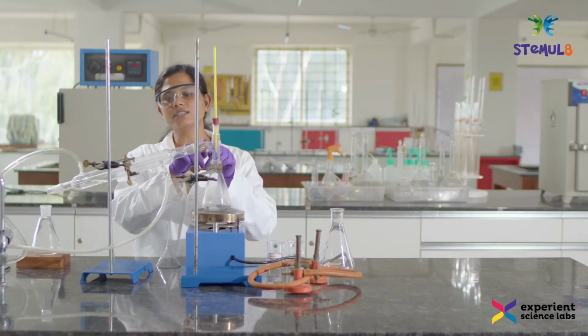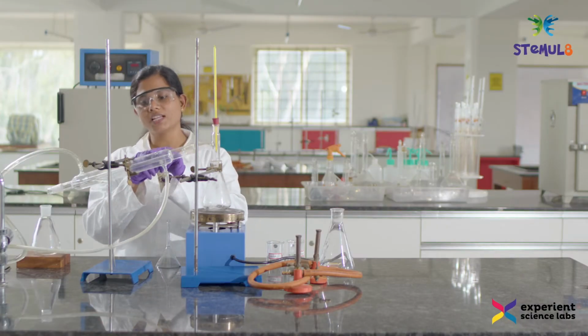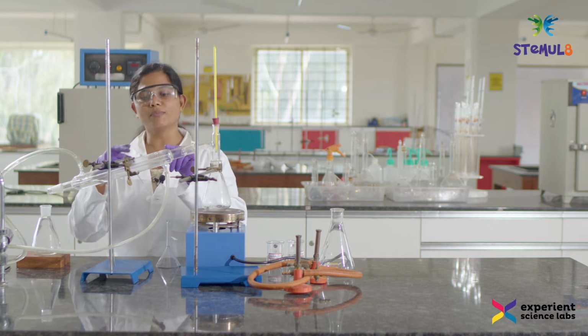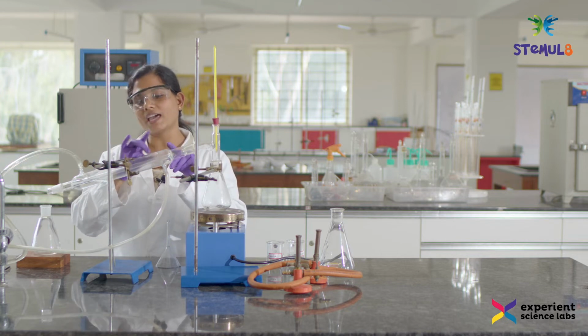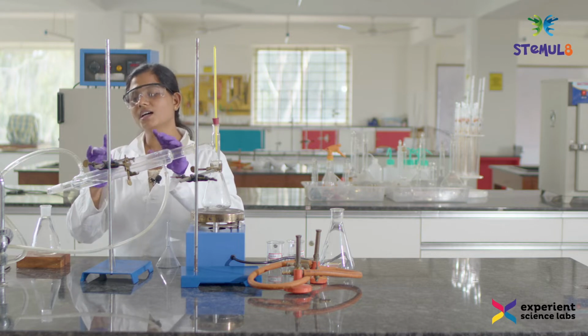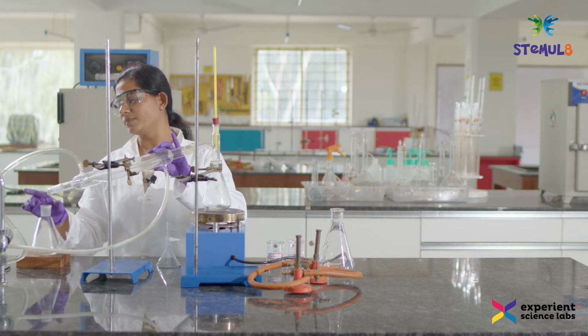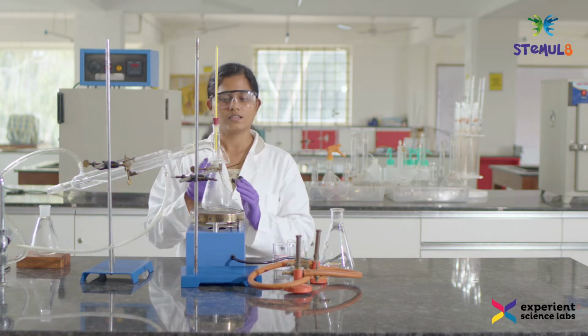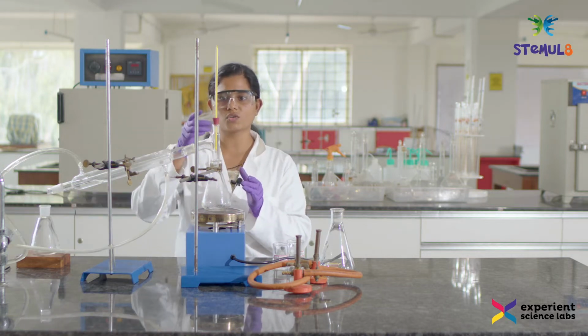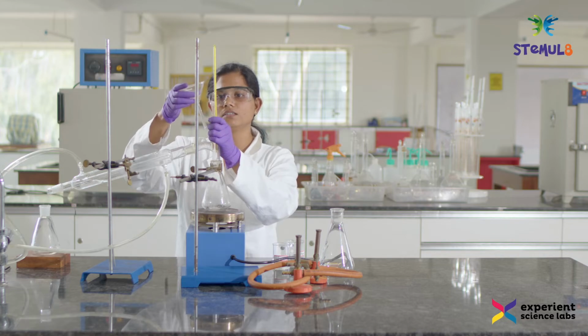The hot vapors pass through the inner tube. These hot vapors will be cooled by the water that is present in the outer tube, and then these hot vapors will be condensed and collected in the receiving flask. Let us now transfer the solvents with the help of a funnel.